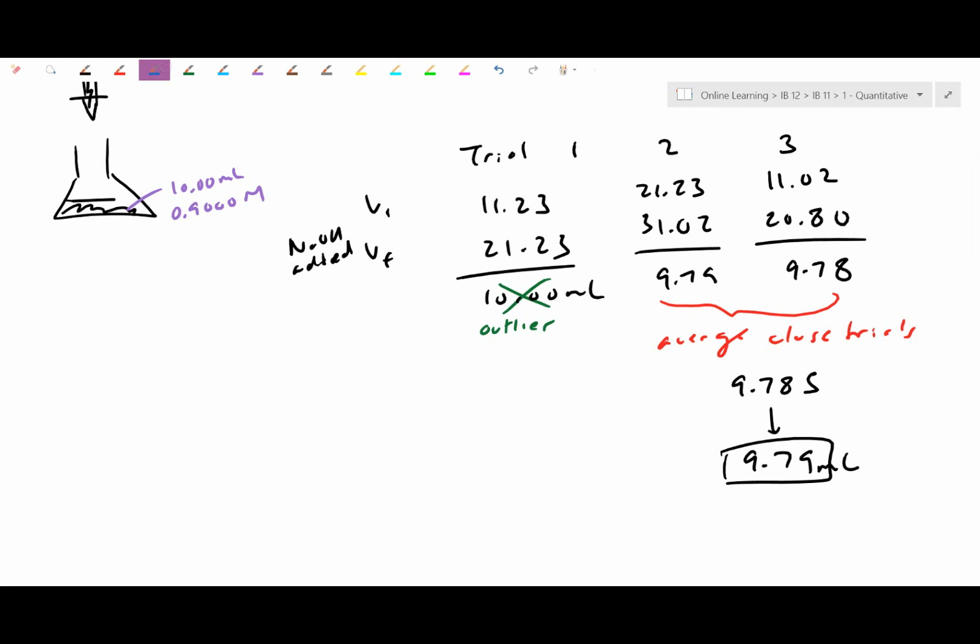At this point here, although it was really tedious to actually get to these numbers here, right now it just ends up as a stoichiometry problem. KHP reacts with NaOH. It actually reacts in a 1-to-1 ratio. We're going to get NaKP, the salt, and then H2O left. Obviously, there's other parts to the chemical as well. Let me just write down the numbers as we know them.